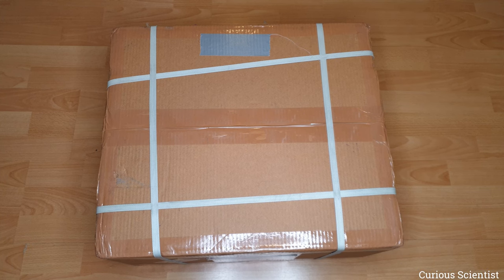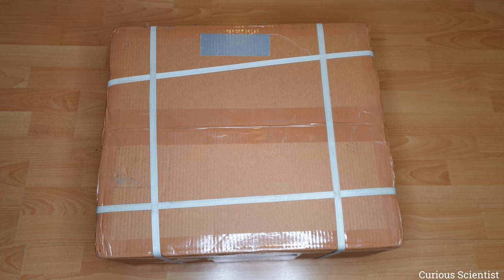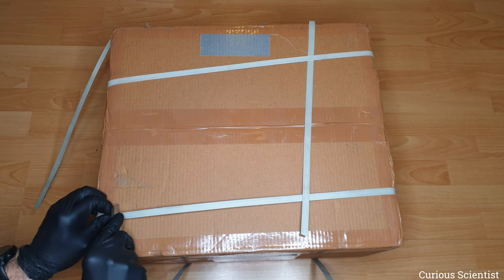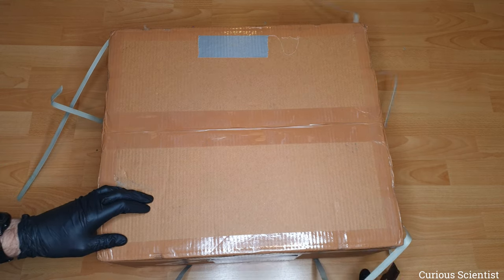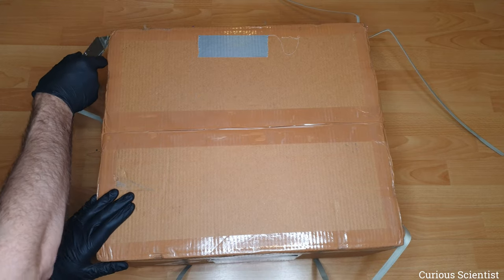Welcome everyone! In this video I'm going to show you my new scientific instrument which can be found in this box. It is a metallurgical microscope made by an Indian company called Radical Scientific. This is not a promotional video but an unboxing and review video. I bought this instrument with my own money because I was curious about it and I wanted to have a more decent microscope than I currently had.